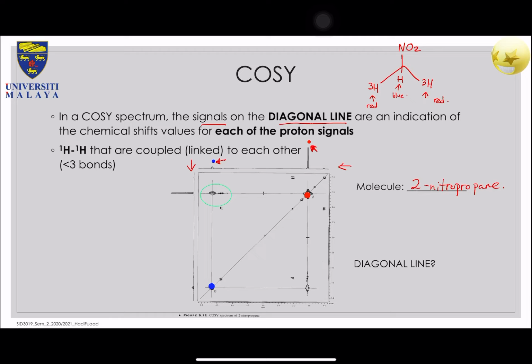If you look at the X and Y, you will get a huge peak forming when these two protons are proximate to one another. And additionally, you'll get to see that this proton and that proton, because it's 2D NMR, will show another peak on that particular region.